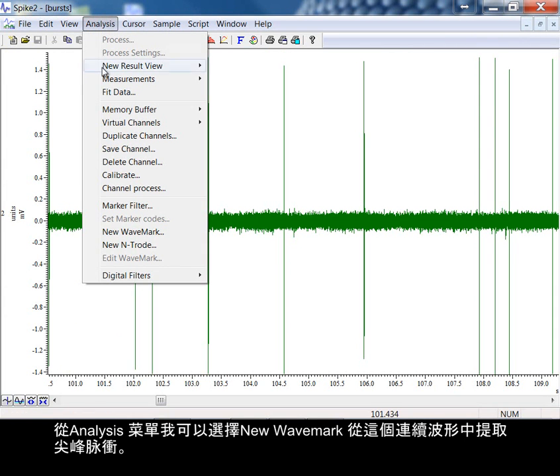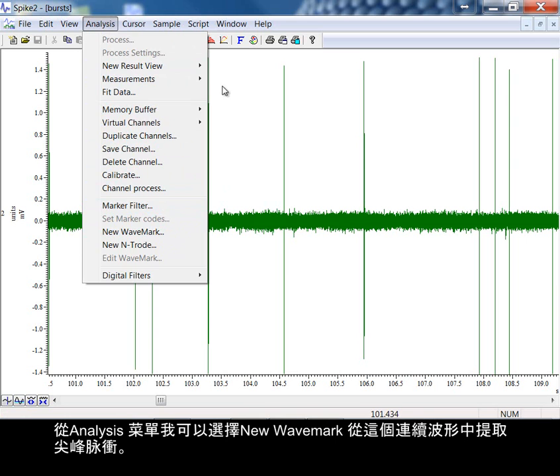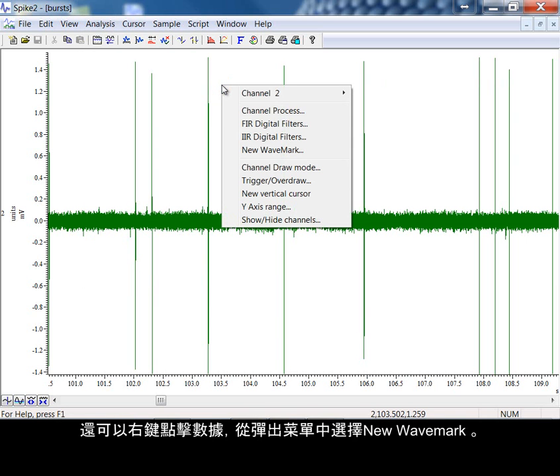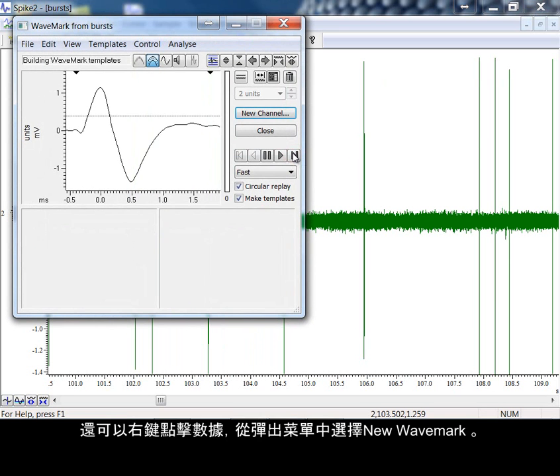From analysis, I can choose New Wave Mark to extract spikes from this continuous waveform. I can also right-click on the data and choose New Wave Mark from the pop-up.